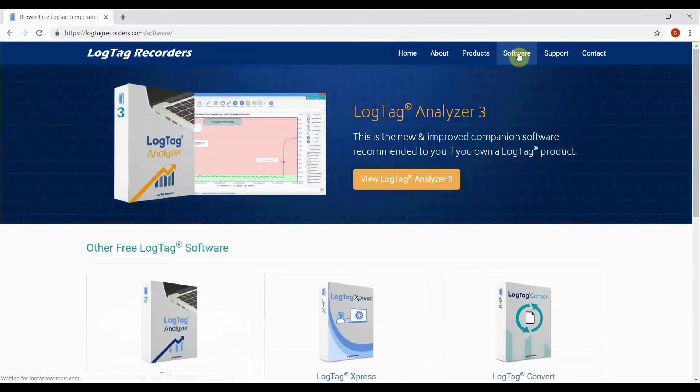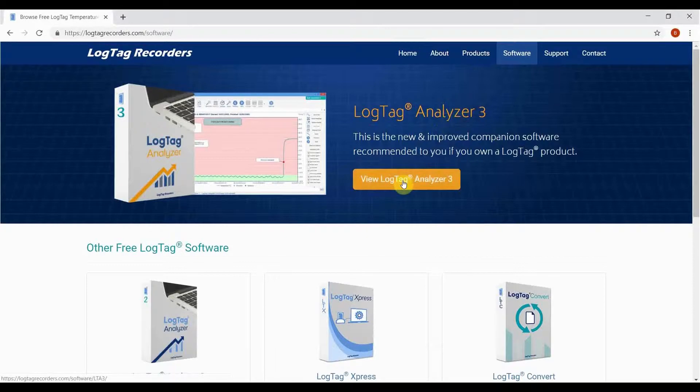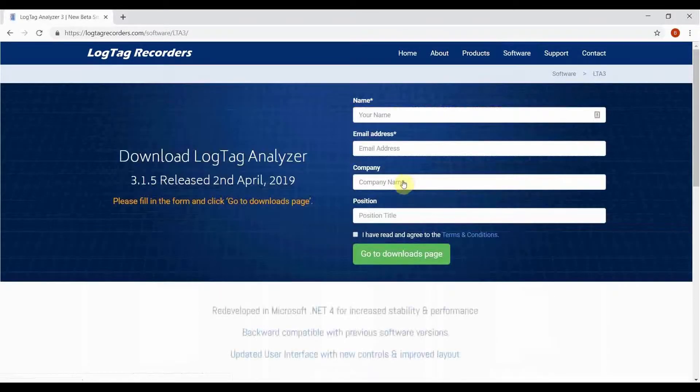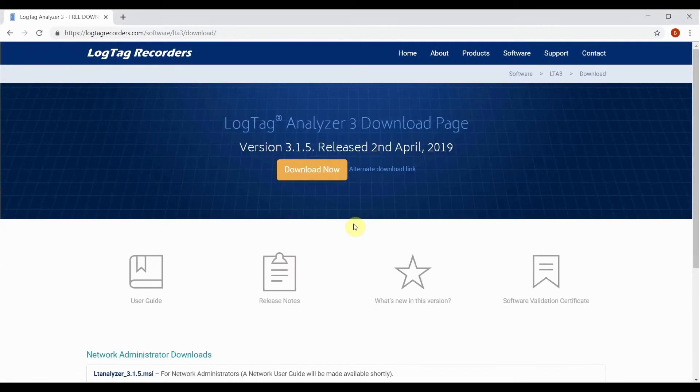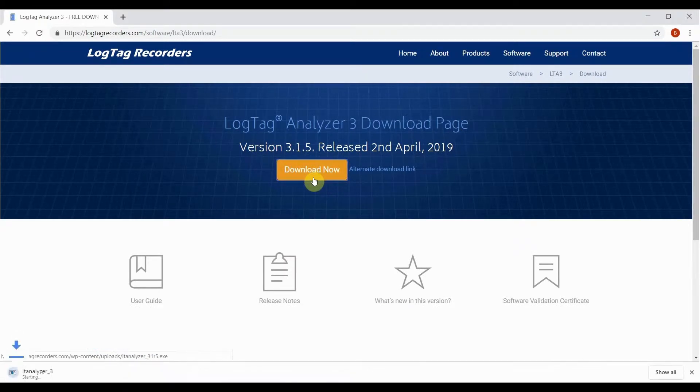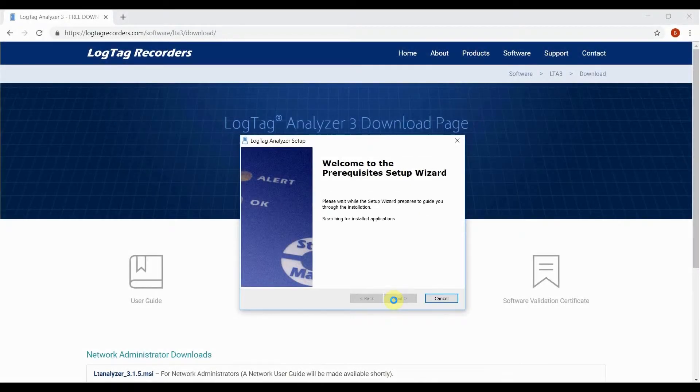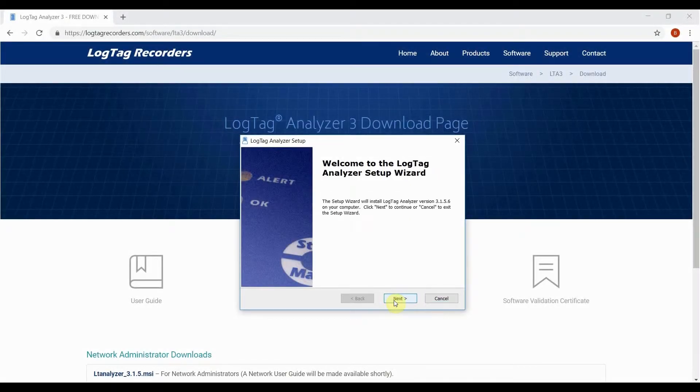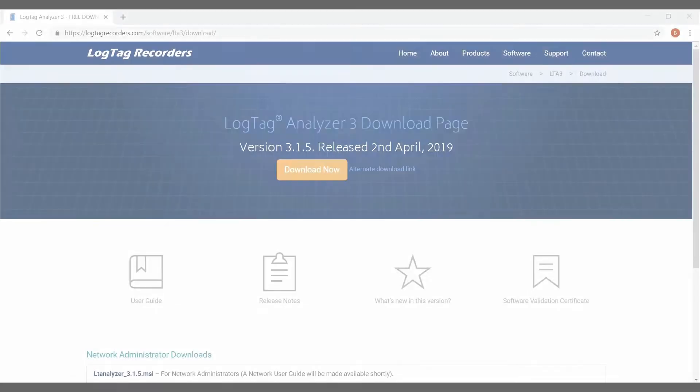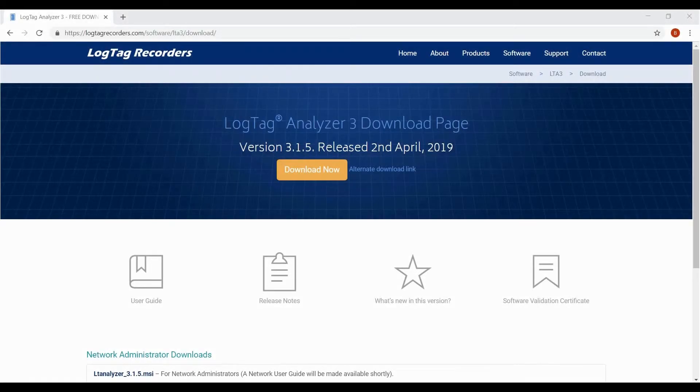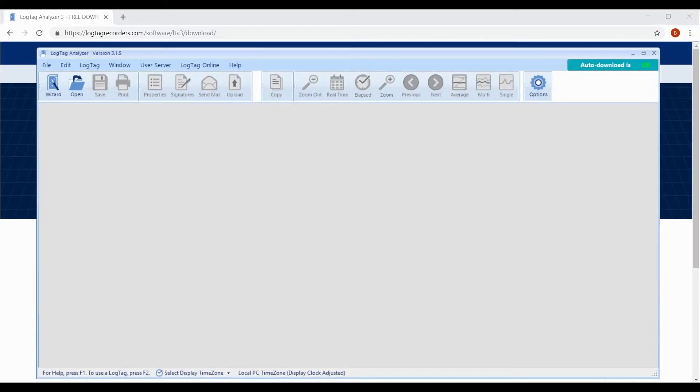Navigate to software, click on LogTag Analyzer 3. Enter in your details and finally click download now. Once downloaded, install the software by following the on-screen instructions, then open the software by clicking on the shortcut on your desktop or from the start menu.